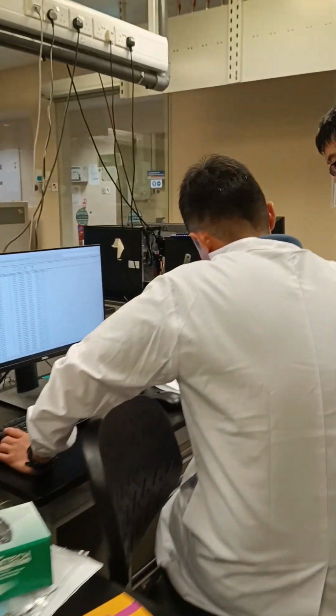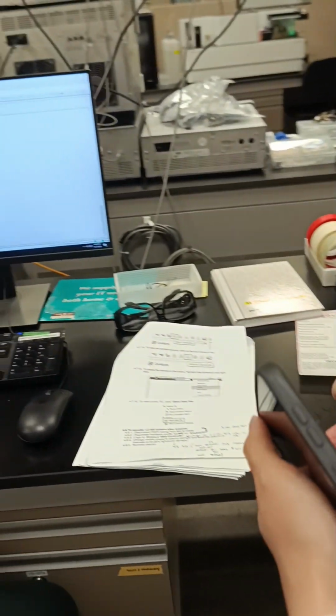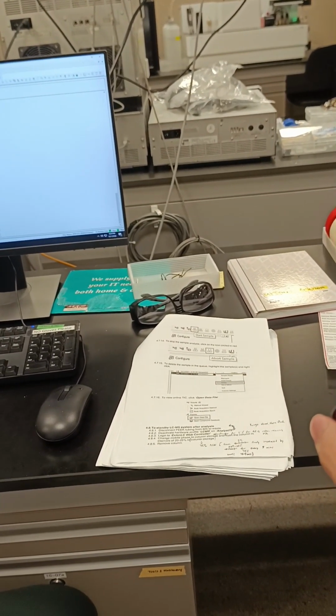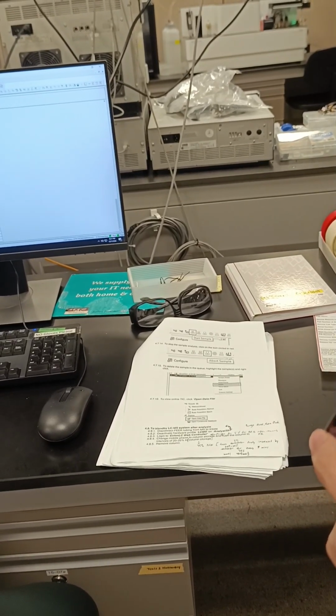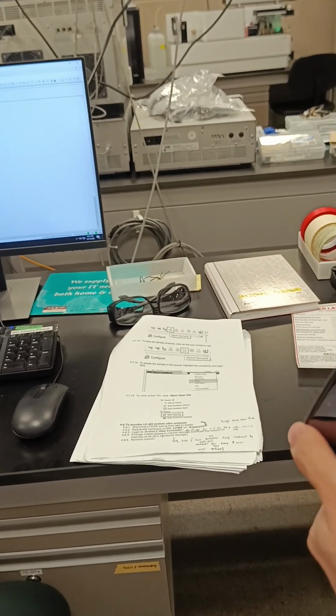And then you just deactivate the LC. Just now we logged out from the LC, right? And then we connected LC and MS together. But now you do it the reverse way. You disconnect LCMS, you go back to the LC software, and then you flush and purge from there. As simple as that.